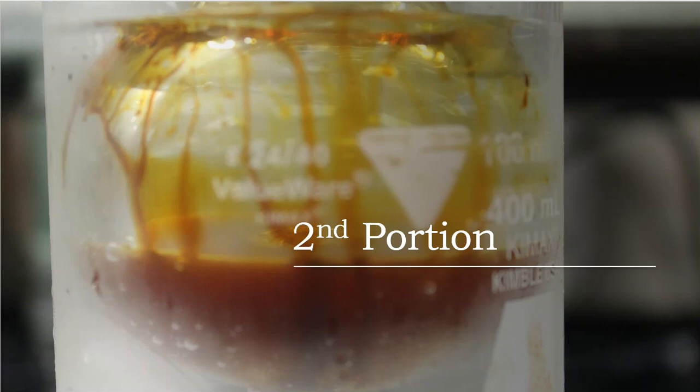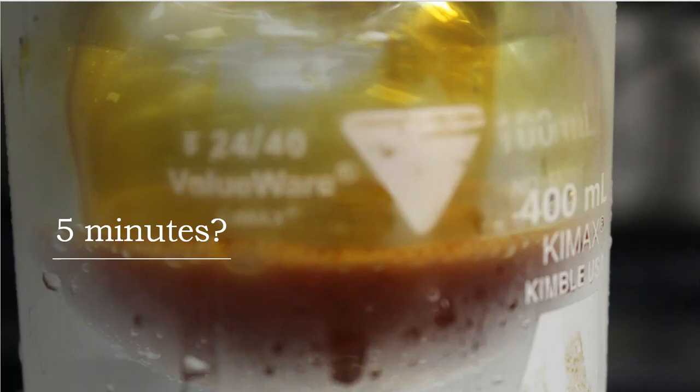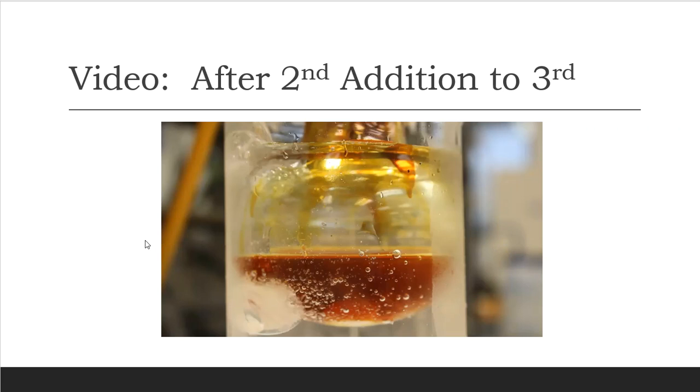All right, so second portion, that's it added. Again, observational changes. It tells me to wait 5 minutes. Okay, I'm waiting. But this never lightened up like the first portion. And this is pretty common. I wasn't alarmed. I wasn't surprised. And here's a video of me adding that second portion.